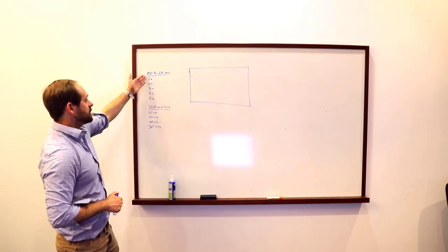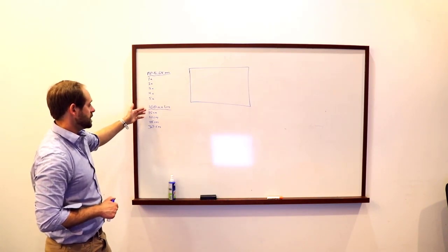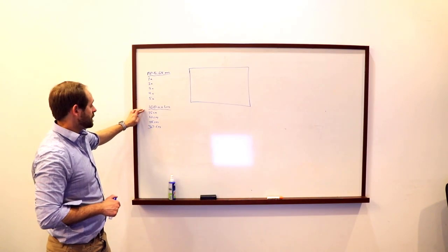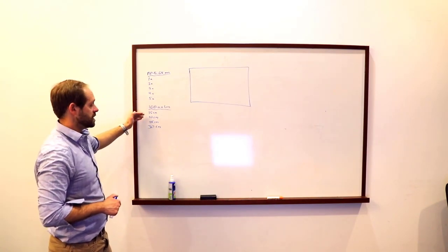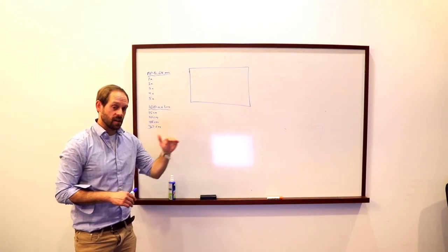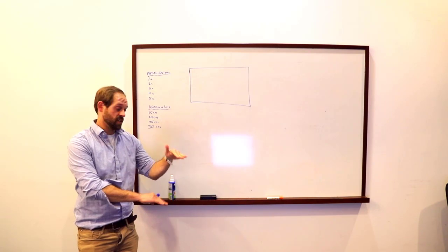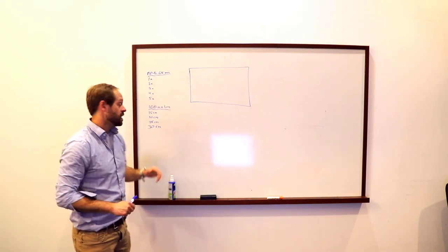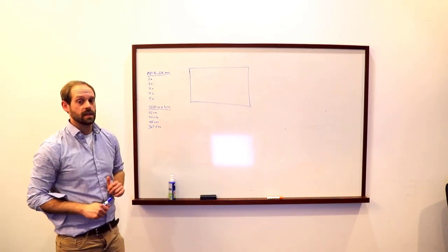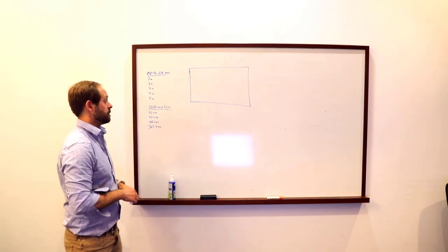So I have the MP65 1 to 5x written out here, the 100mm lens. We're not defined by magnification, but by a working distance. This 15 centimeters is denoted by the front of the lens down to where the focal plane is contacting your sample. If that distance is 15 centimeters, that's the number we're interested in. That's why everybody's kit is provided with an actual measuring tape.